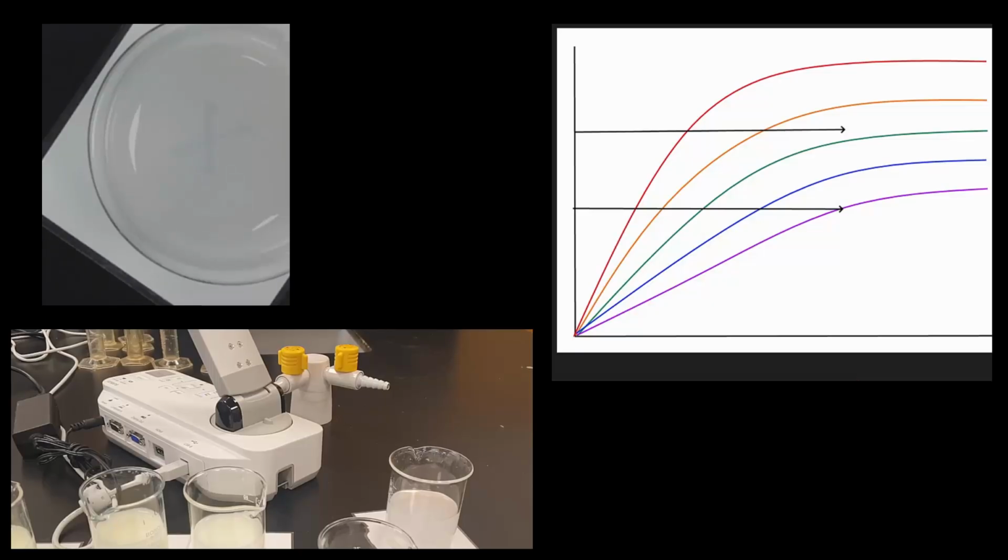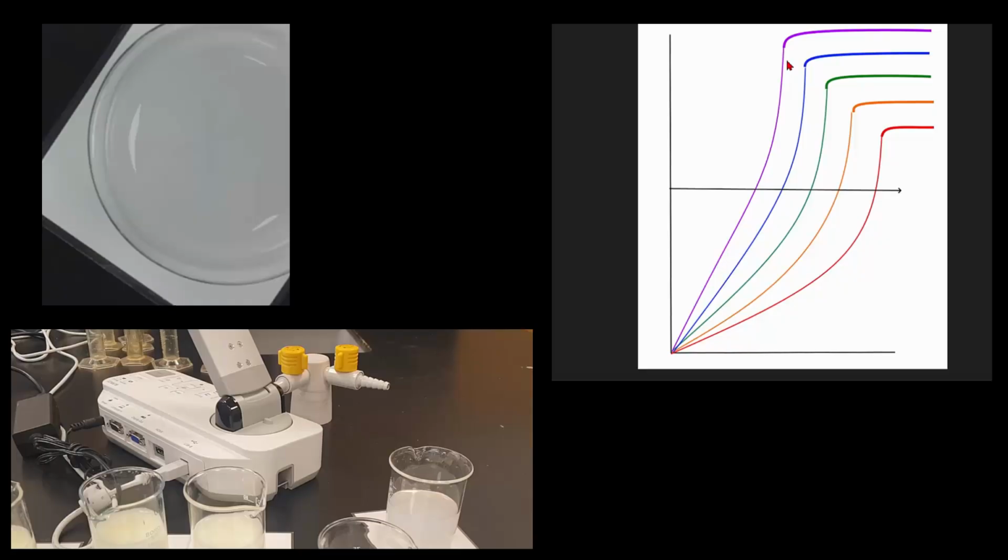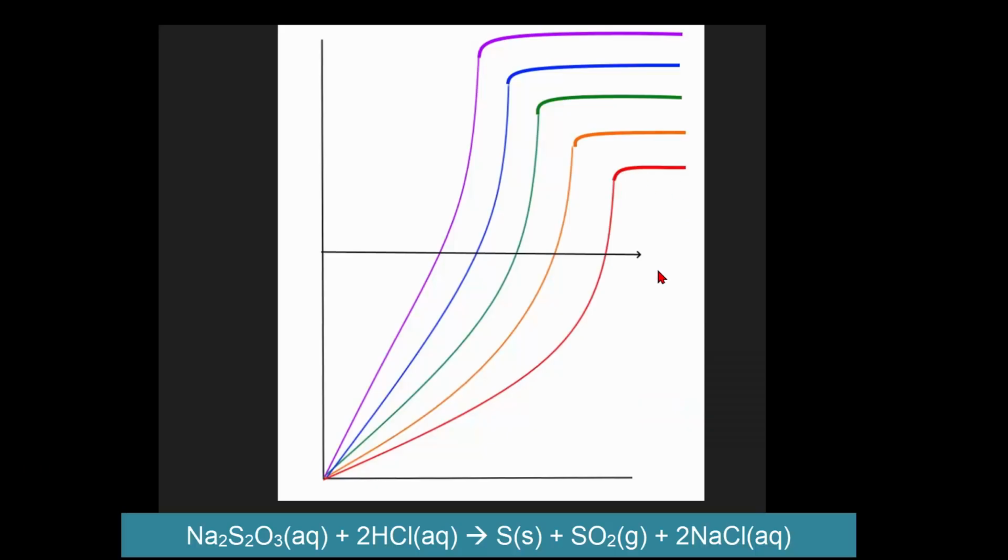It just so happens, as you'll see in part 2, it shows you how to do the experiment properly. So make sure you watch part 2 of this. We use a spectrophotometer, and it reveals that it's actually increasing at an increasing rate, which is quite unusual. So in most cases, unless you go right up here, you're going to be safe. Even though it's a low concentration, it will be fast enough and enough of it to cover up the X.